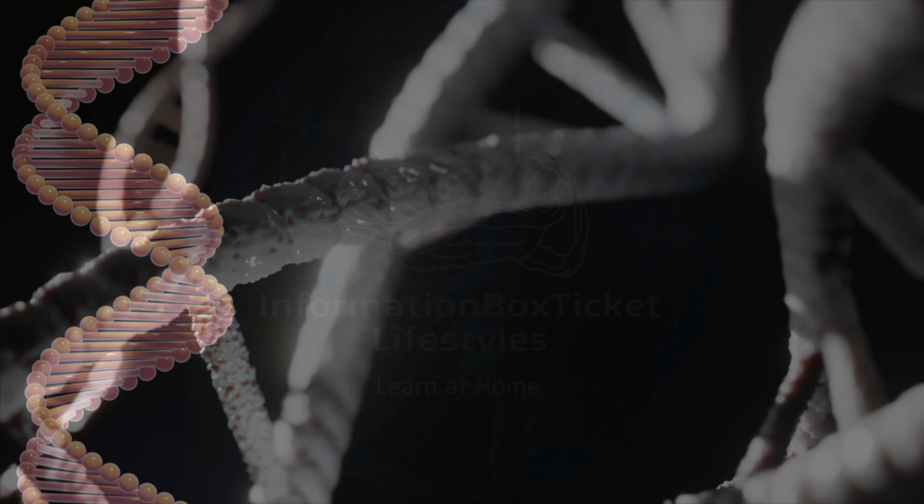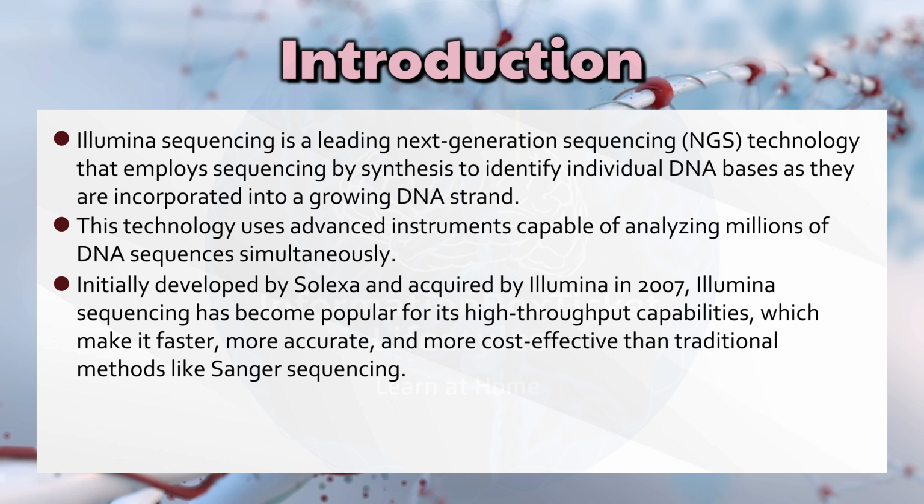Introduction. Illumina Sequencing is a leading next-generation sequencing (NGS) technology that employs sequencing by synthesis to identify individual DNA bases as they are incorporated into a growing DNA strand. This technology uses advanced instruments capable of analyzing millions of DNA sequences simultaneously. Initially developed by Solexa and acquired by Illumina in 2007, Illumina Sequencing has become popular for its high-throughput capabilities, which make it faster, more accurate, and more cost-effective than traditional methods like Sanger sequencing.